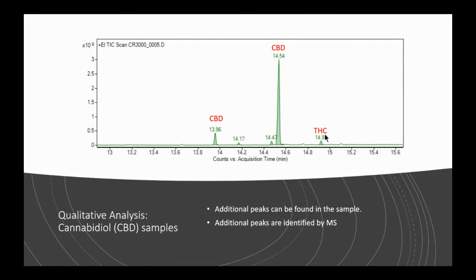Now, I point that out because I'll show you here in a moment that the FDA has a level. The cannabis plant, the hemp plant, is not a marijuana plant. And so therefore it has a level of THC in it, but you should not have a huge amount of THC in it.